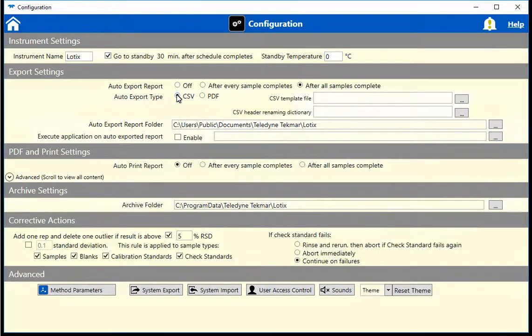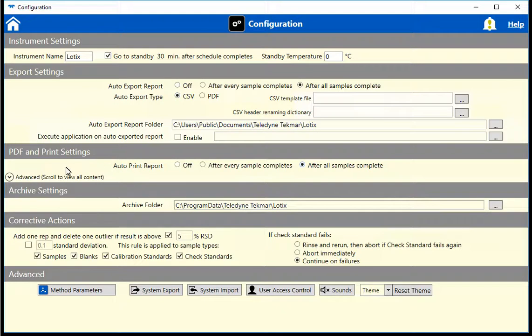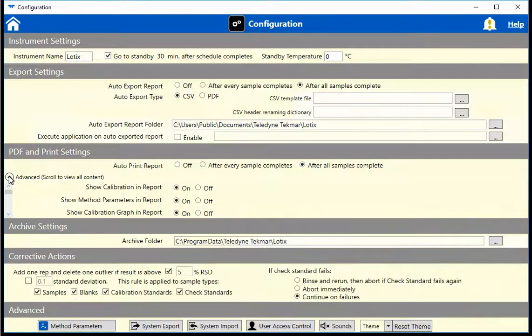Entering when to automatically print the report can be done in the PDF and Print settings. In addition, there is an Advanced tab that, when opened, provides more customization to the report, including customized formatting, logos, and language.